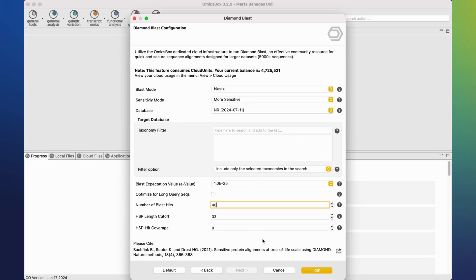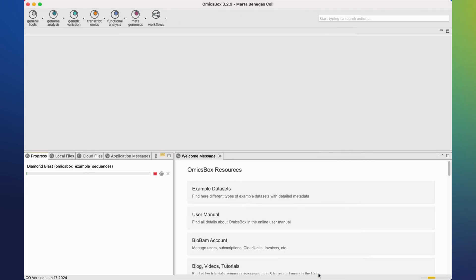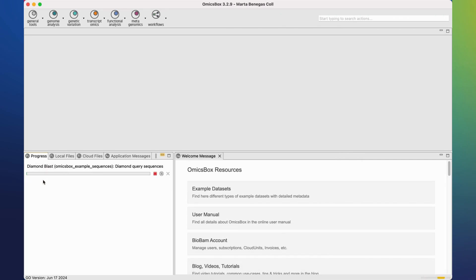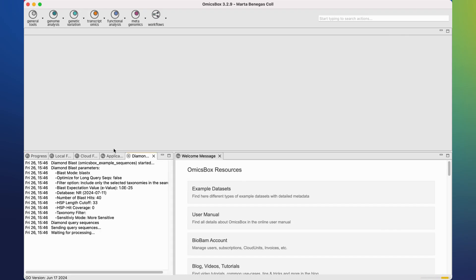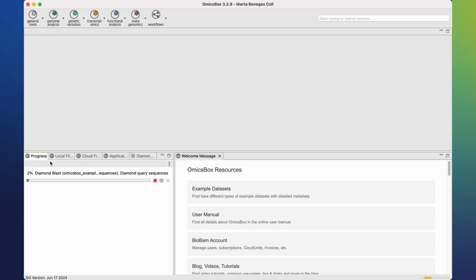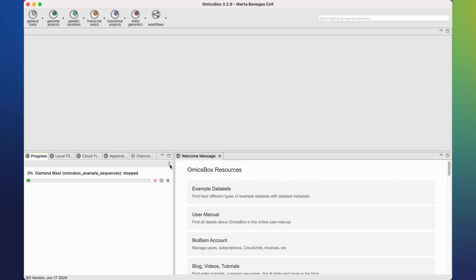Once everything is adjusted, click on run. A progress bar will be shown in the progress tab. You may click on this button to obtain a more detailed view of the analysis steps. You may also click on the square red button to stop the execution. Click on remove finished jobs to clean the view.